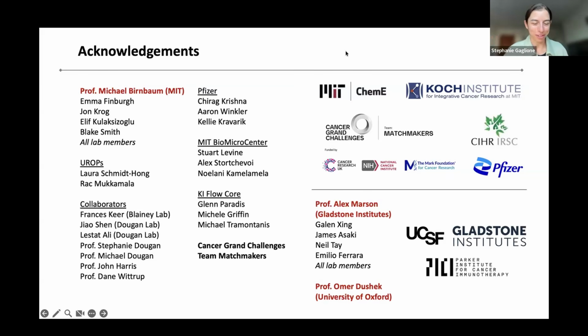Yes, so that's a great question. It's something I think about with a lot of new approaches. The first is, we did do testing across the physiological range of affinities. That was pretty important. So pulling out, this is actually from work done in Omer's lab, sets of TCRs that had validated antigen affinities using SPR, and then being able to confirm that we could hit the low, like 100 micromolar without an issue, even as low as 150, being able to detect it. But of course, I didn't really feel that was enough. And so in the context of this work, we had decided to use peptide pulsed APCs for that reason.